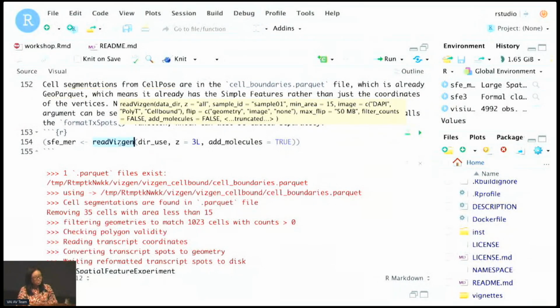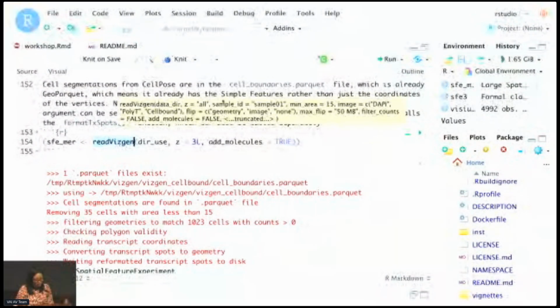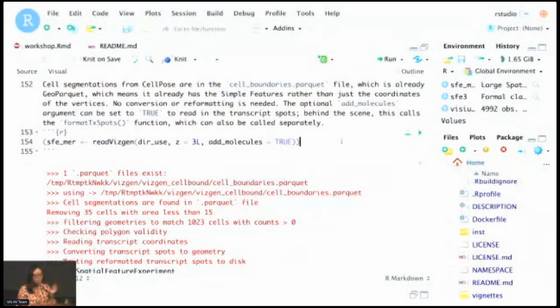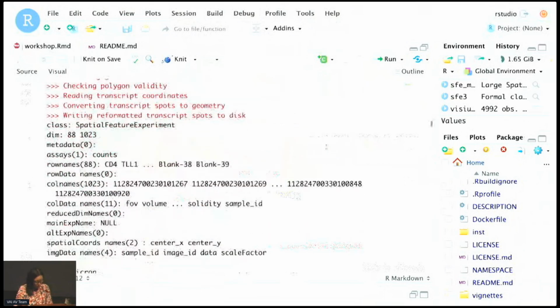And then the other thing on add molecules. For these small example datasets, there's no problem reading them into memory, but for real datasets, these are huge data frames with millions of molecules. Are there any concepts of out of memory, any database backend, anything like that? Actually, as it's in the text here, it's still in the very beginning of development. For one of the example datasets, the detected transcripts CSV file is 30 gigabytes, and I have to use a server to process it. But I will get to that here.